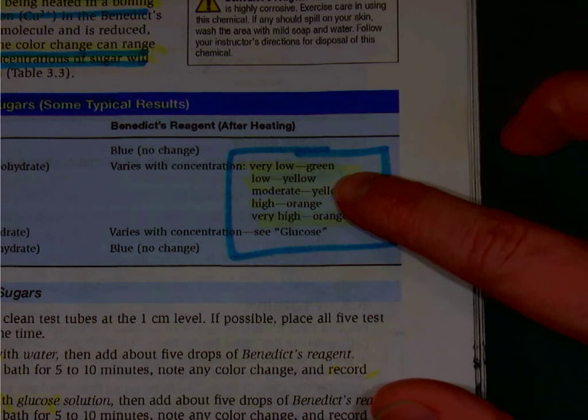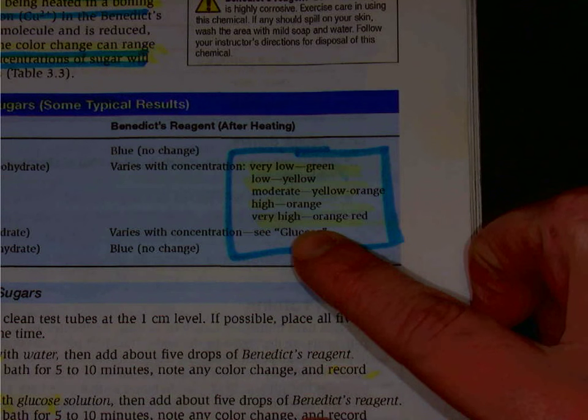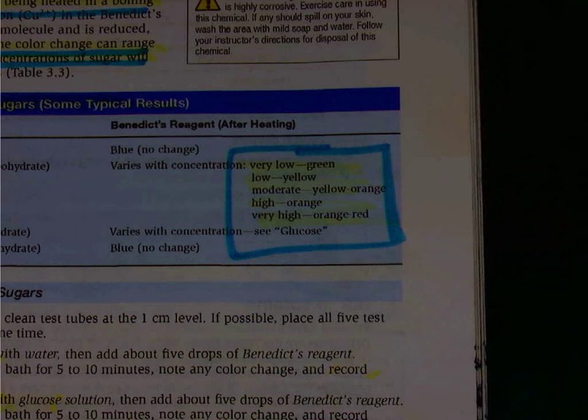If we have a very low amount of sugar present, then our Benedict's goes from blue to a greenish color. If we have a high or very high amount of glucose or other sugar present, then our solution is going to turn an orange or orangey red color. So we have a little bit of a relative amount. We know a little bit of sugar, a lot of sugar present when we're testing with Benedict's.